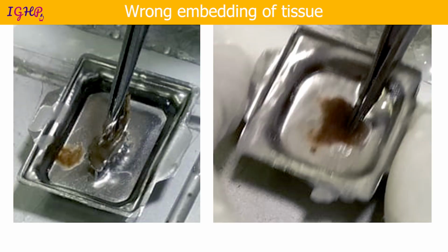Then sometimes when you have got a new technician in the department, they can do wrong embedding of the tissue. So you do a grossing of a gallbladder and you are only seeing muscle, or you take sections from the cyst wall and you are not able to see the lining epithelium. Go back and see how the technical staff has embedded the tissue, or ask them to melt the block and then do the re-embedding. So that applies to the cyst wall and the gallbladders. Then there are certain specimens like muscle and skin for alopecia. Those are to be embedded in a different way.